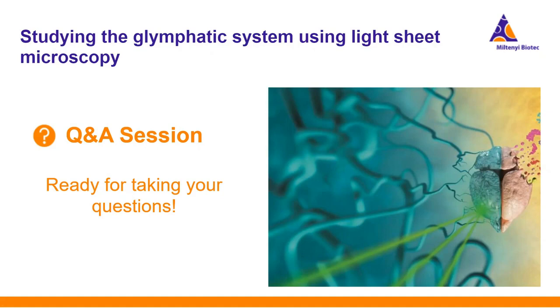What this new and particular model of the light sheet microscope does is that for one field of view, it will actually adjust the light sheet so that it takes multiple images. I think maybe a standard of 32 images combined into one image for one field of view.